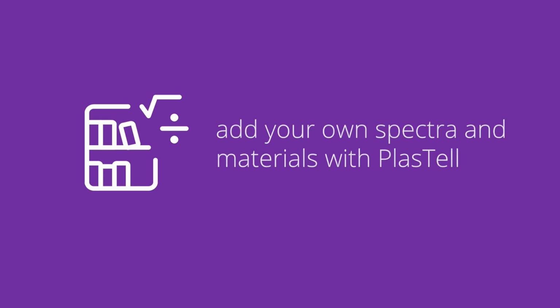We try to include as many materials and spectra in our plastic spectra library as possible, but sometimes customers have special requirements or would like to identify non-standard materials. That's why we have added the ability to add own spectra and materials. Note, at the moment, this only works for PlasTell.